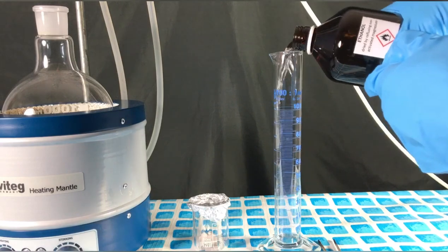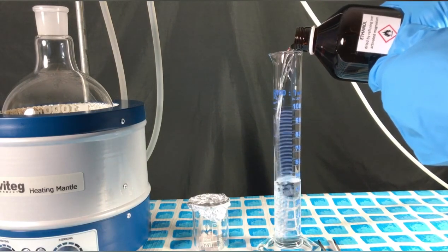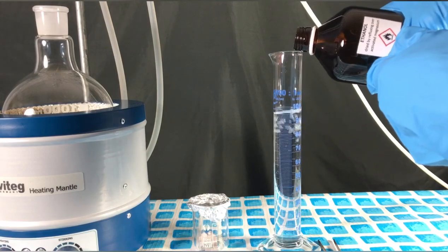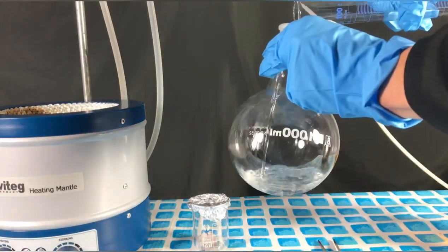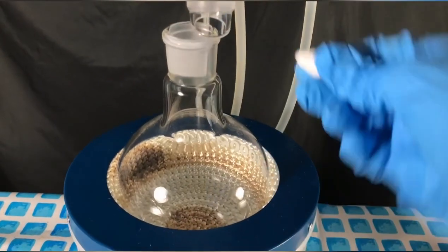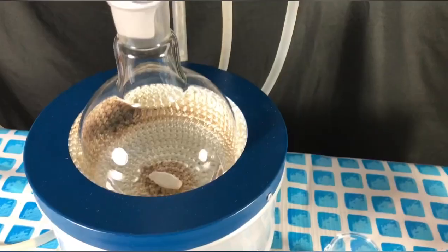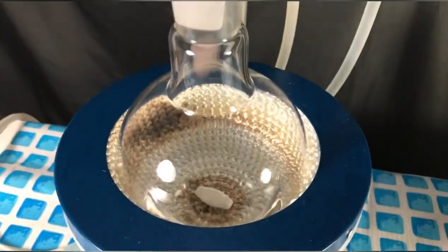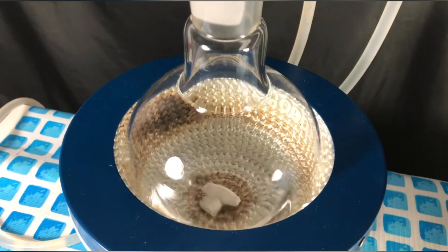Afterwards, 125 milliliters of dry ethanol were measured out and added to a 1 liter round bottom flask. A stir bar was placed into the flask. Then all of the metallic sodium chunks were directly thrown into the dry ethanol.